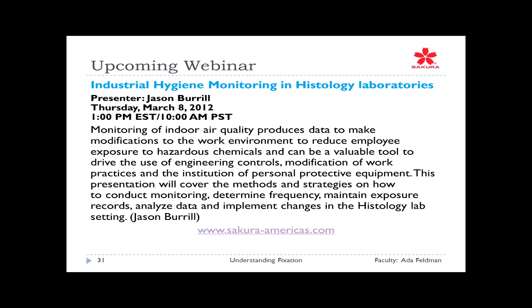Thank you. The next question is, is there a formula for infiltration on a fast cycle with heat and vacuum for time? A lot depends upon the size of the specimen and your whole processing schedule, so there's not anything we can give up front.